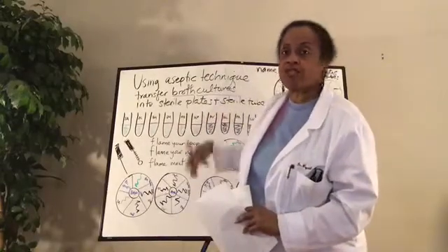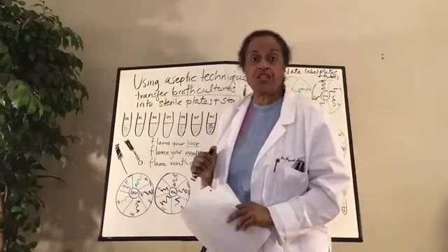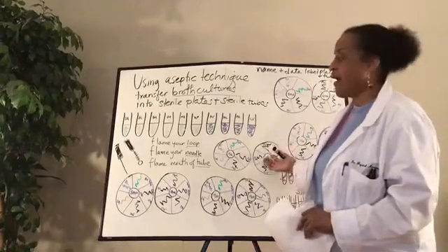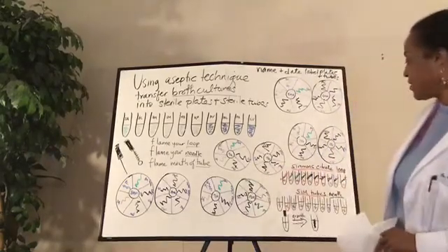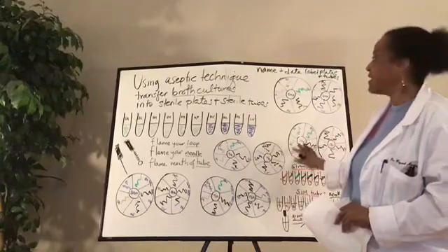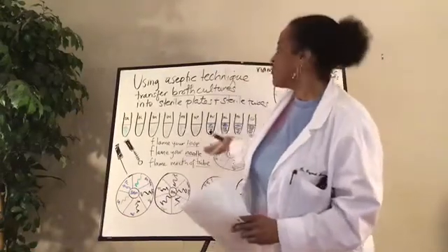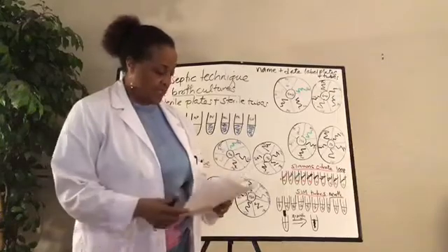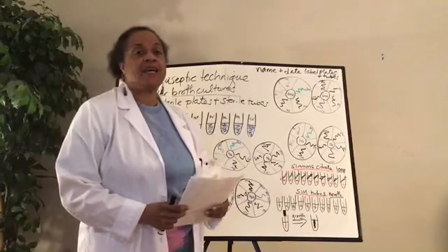So the first part of this, when it was just all clear and you just drew all of your bacteria here, that was part of your procedures. Now that you've grown, you inoculated, and say it's 2 days later, like Wednesday, because you're doing this lab today, now your bacteria has grown. So now these are results. These would be considered what you did the day of your procedure. And then the next time would be results, okay? So we'll just say this represents the growth stuff, but I'm just showing you how it should look. Let's go on to the next thing, which will be the table, and how I want you to present this as data in your results.